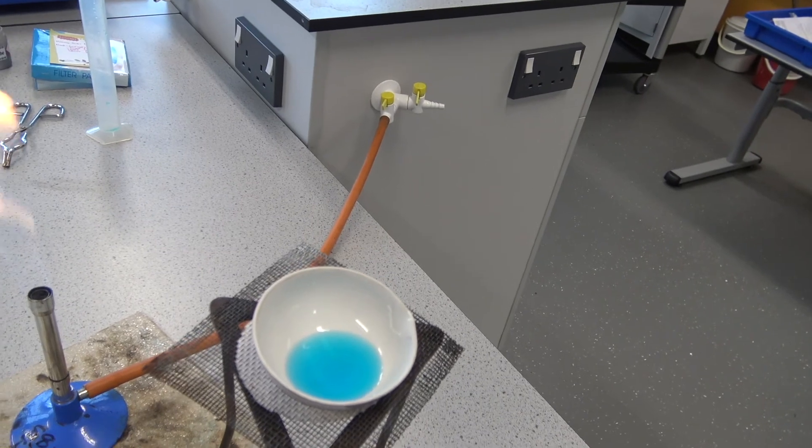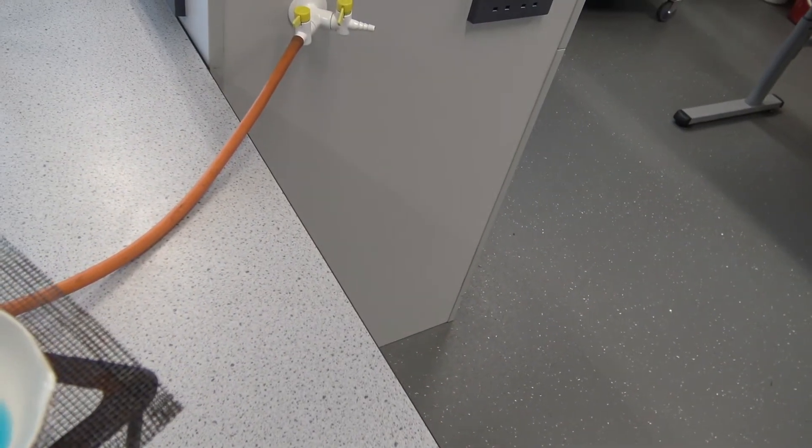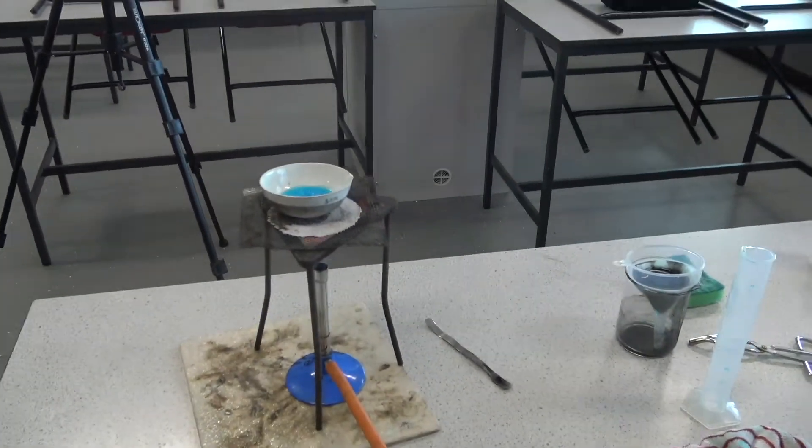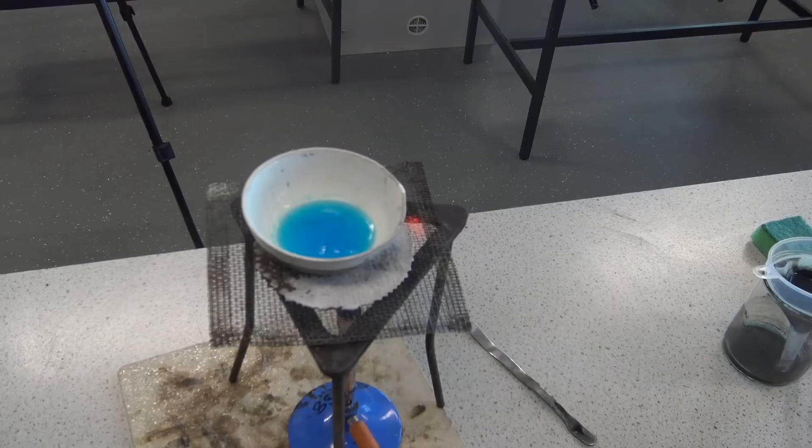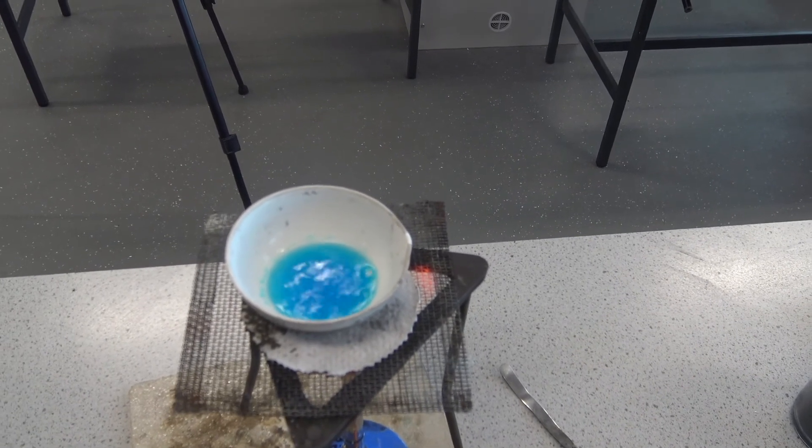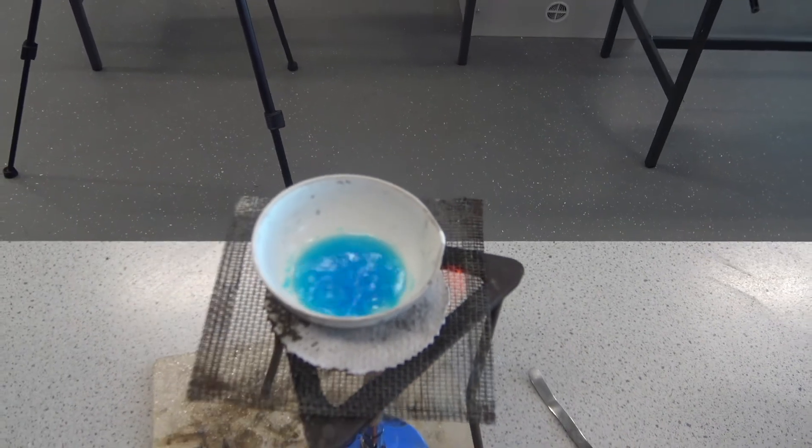We are now going to heat that on a blue flame. Once you start to see crystals form like you have just here and you've evaporated about half the liquid off, you want to take it off the heat.